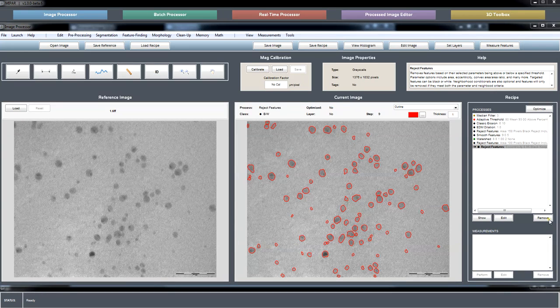There was a bug in that version that prevented a lot of those from opening, but that got fixed in beta 6. So there should be a pretty stable opening of just about any image format you can think of in beta 6. I know Johan was one of the reporters of that bug, so let's see what he says if there's still issues opening those kind of files.